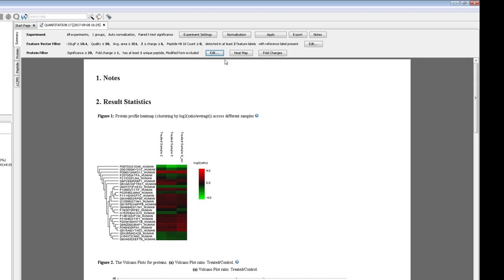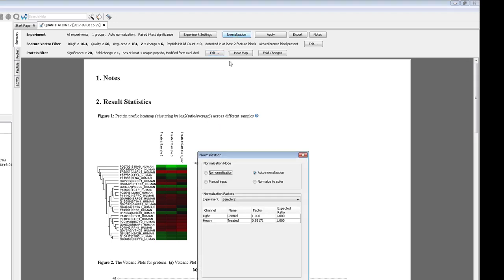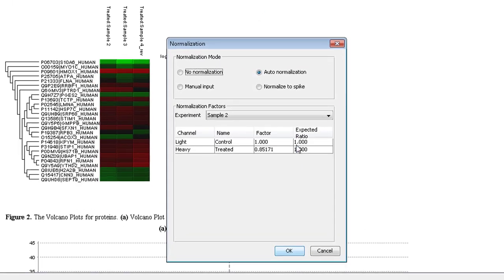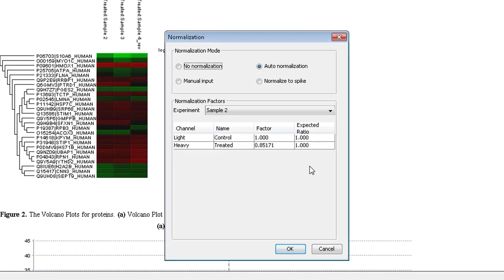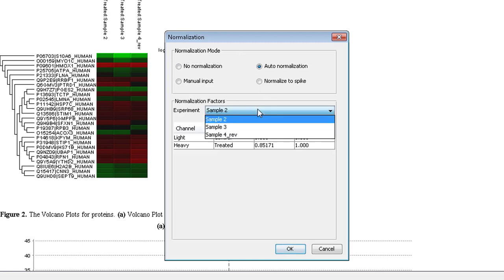The next step is to check the normalization settings. By default, the total intensity of all quantifiable peptides are used to normalize each sample to a 1 to 1 ratio across the whole experiment. Use the drop-down menu to see the normalization ratios for each sample.